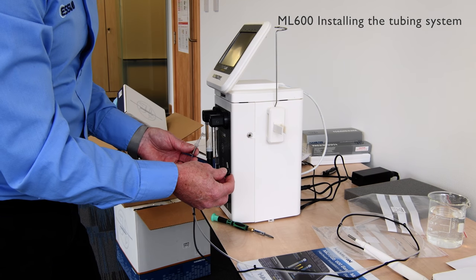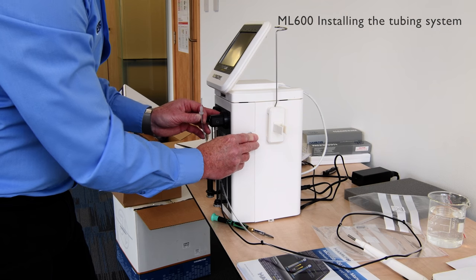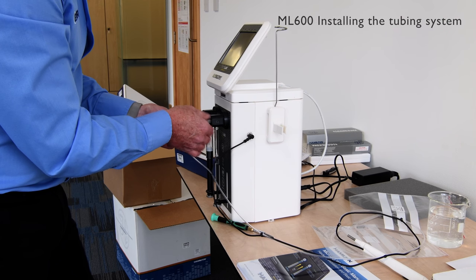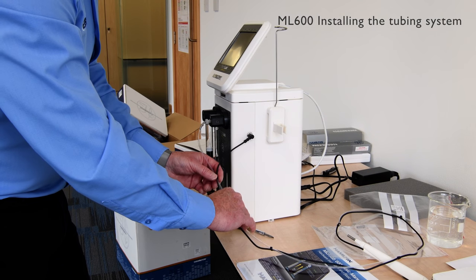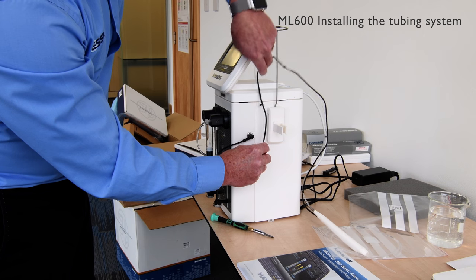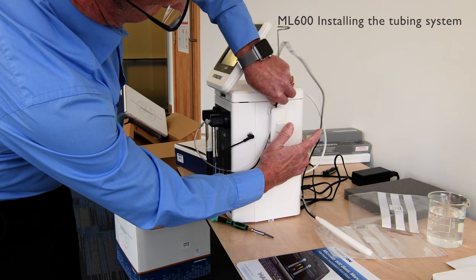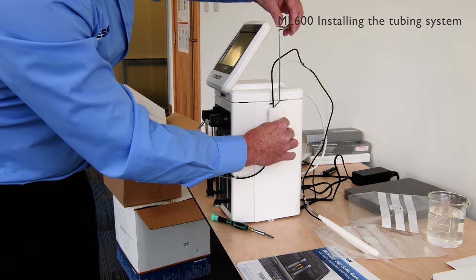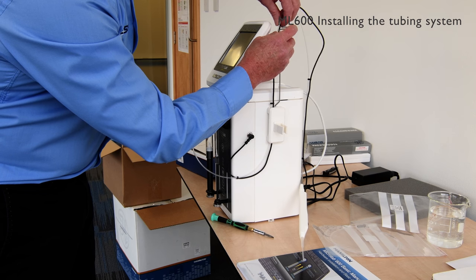Now we're going to fit the tubing line and the probe to the valve. Firstly, we're connecting the probe into its input, and then a fitting screw connector to the front of the valve — finger tight. Once that's secured, we're adjusting the length. Now we're going to place the tubing line through the tubing management system — this is done by simply pressing the side and placing the tubing in. Once secured, the tubing line is held and placed through the top part of the management system.